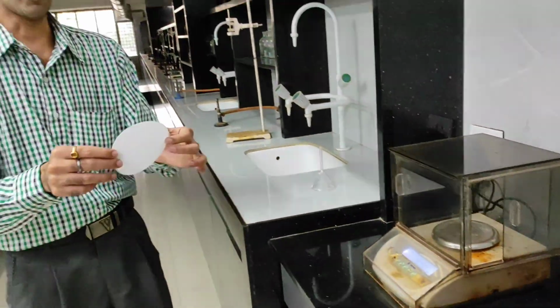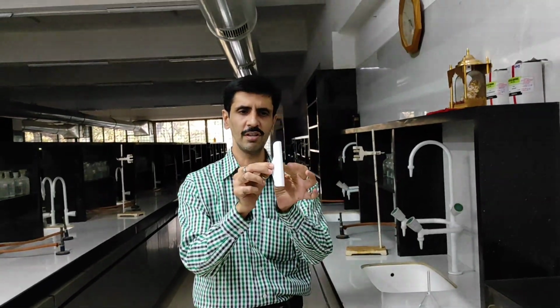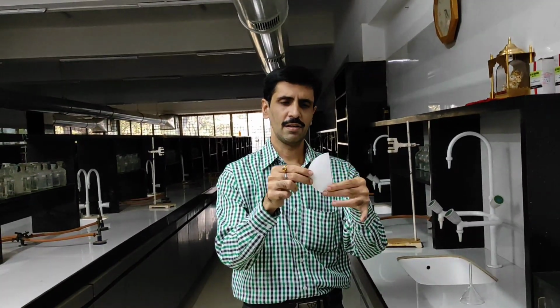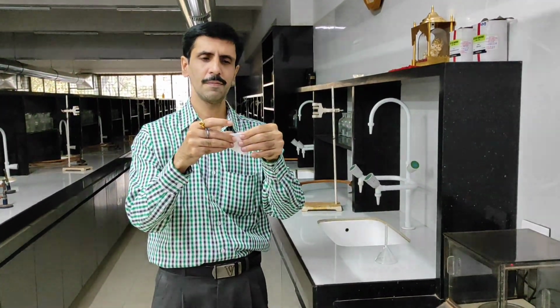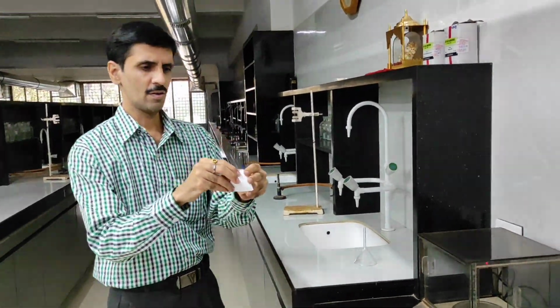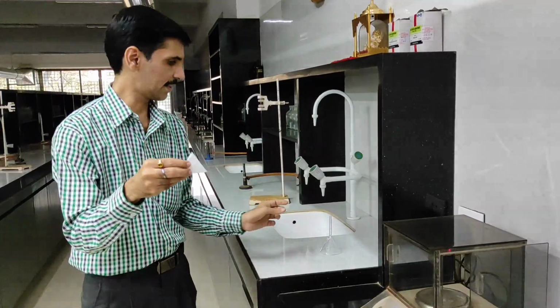Now, the next thing we are going to do is fold this Whatman paper. How are we going to do this? This is the first fold. Next, we go for the second fold. And then one side one and three on the other side.